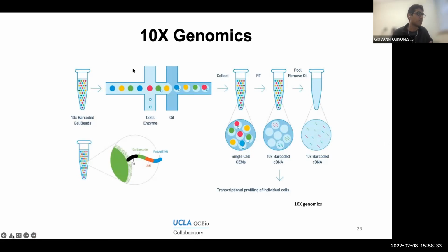And the type of technology being used here is based on barcoded gel beads. We mentioned a similar example when we were talking about the microfluidic technology.